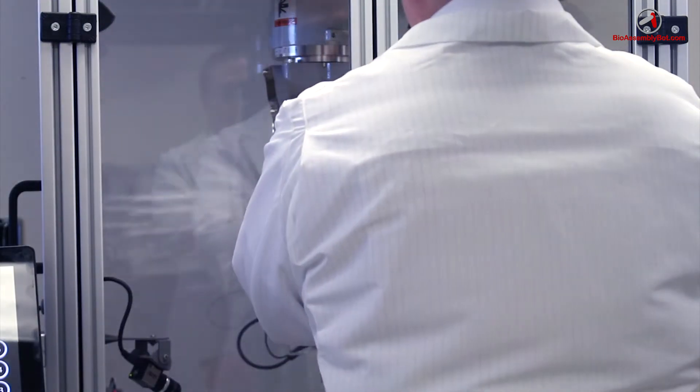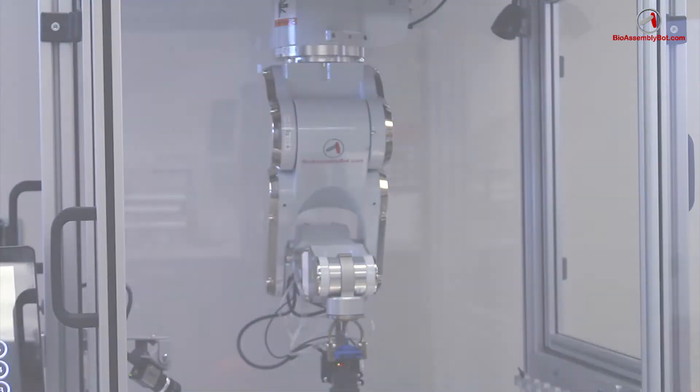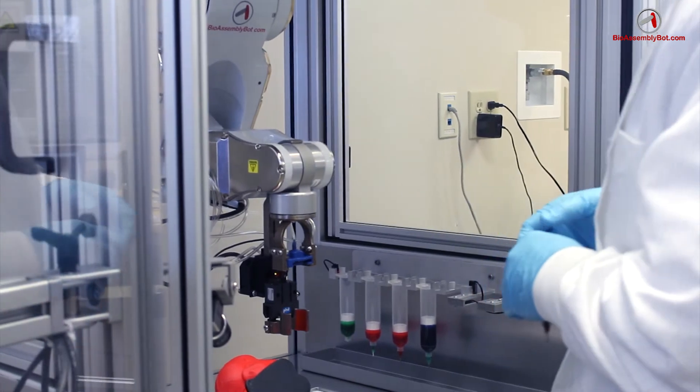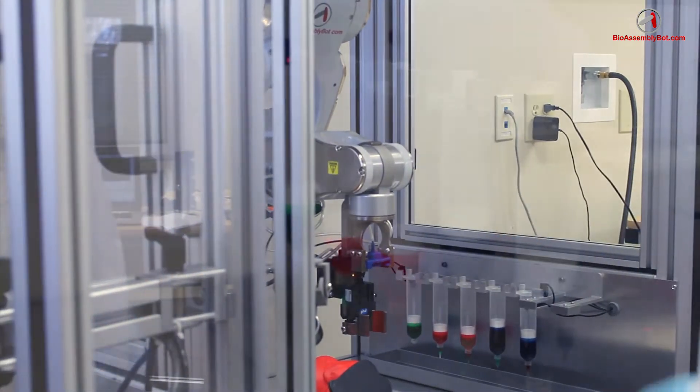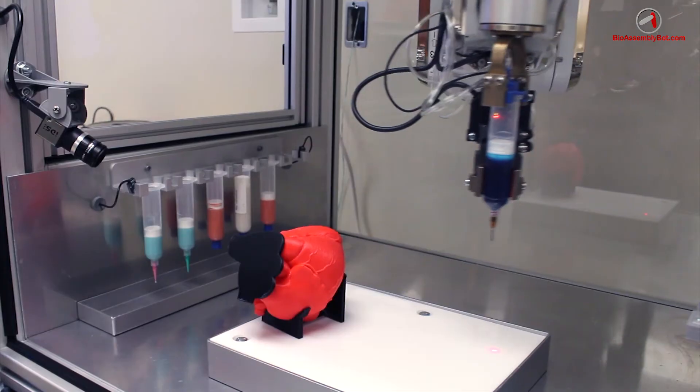Before printing, we'll load in material to represent the vascular tree in two different cartridges, with each cartridge containing a different diameter needle representing the two different calibers of vessels that will be printed in the tree, here shown in blue.